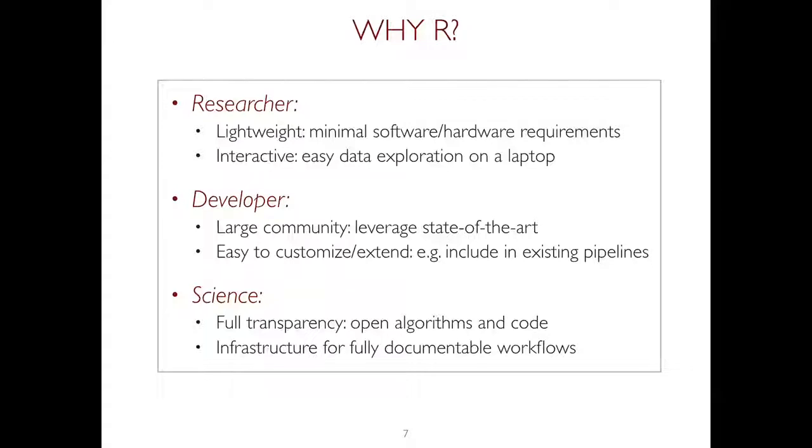And let me tell you upfront that everything we do is free and open source, and we develop things in R. And you know that R is very popular in the statistics community. That was one of the original reasons, but I think there are more reasons than that. So from the user perspective, for the scientist or researcher, we find that it is really easy, right? So it's lightweight, with minimal software or hardware requirements.